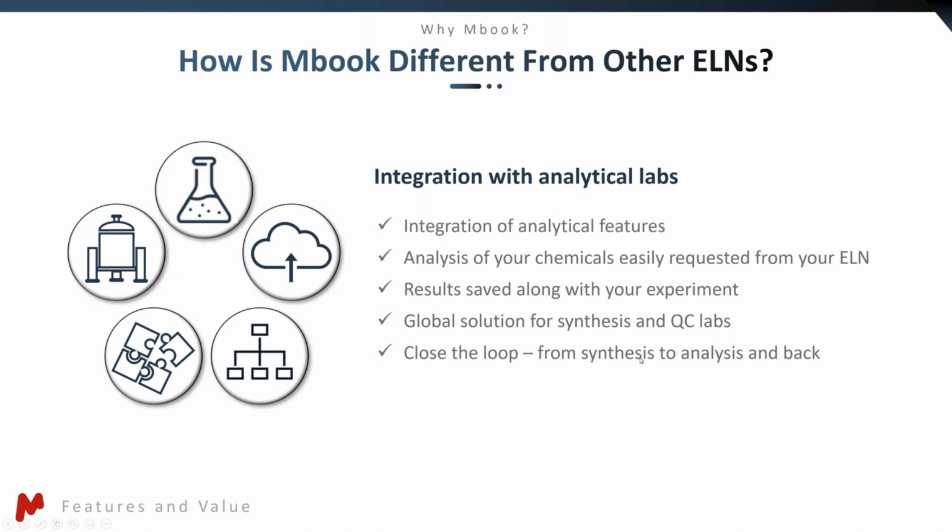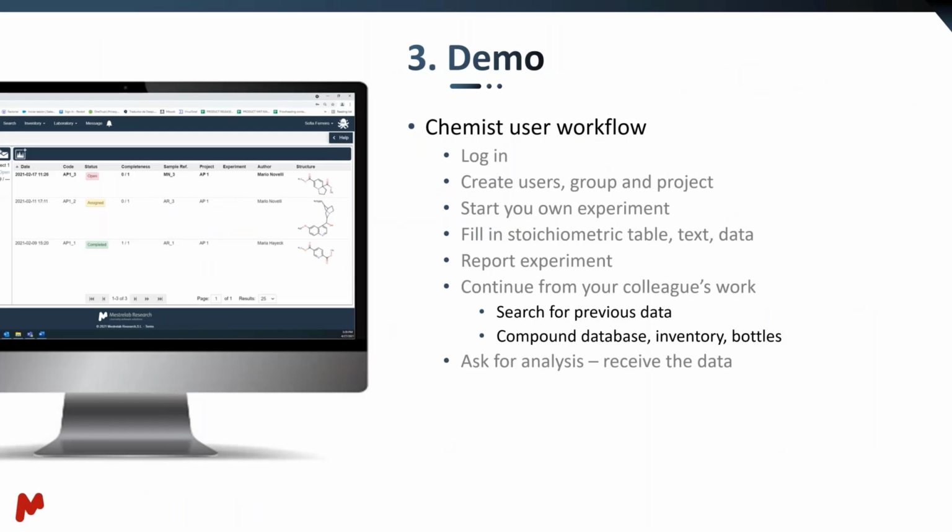So let's say for QC labs. And the point is to close the loop from the synthesis to analysis, and once again back to the synthetic chemist.